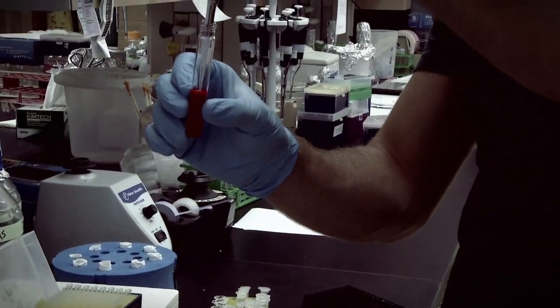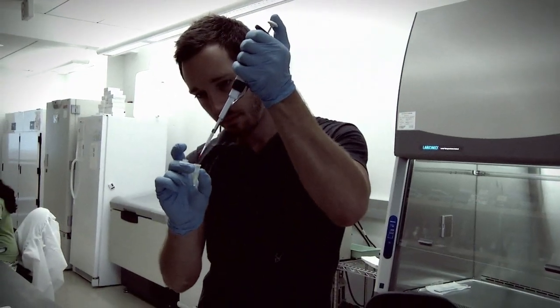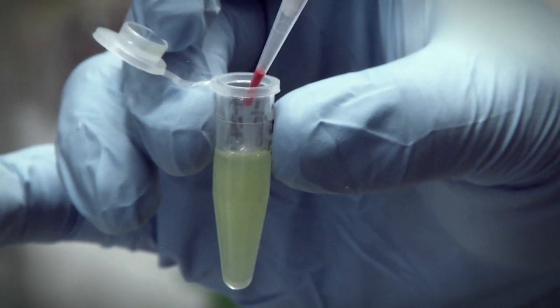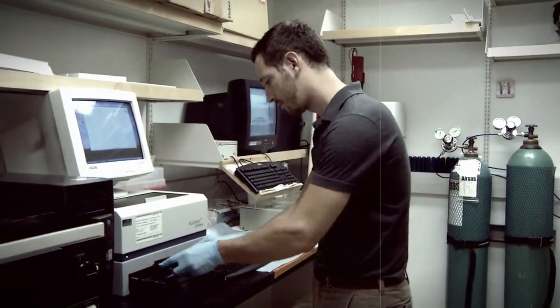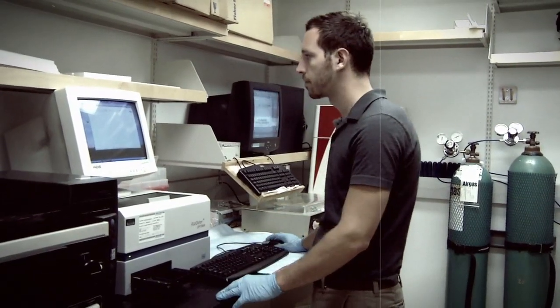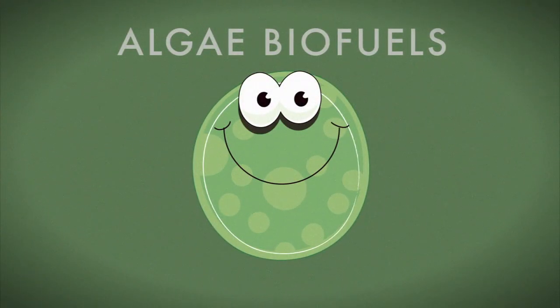The algae samples are given a special red dye called Nile red dye. This dye will stay in the oil droplets red. Therefore, the redder the sample gets, the more oil it has produced. You might think that measuring the amount of color in something could be done by looking at it, but actually an instrument called a spectrofluorometer is used. If your sample has made a lot of oil, then there's a chance it could be useful as the next great biofuel.